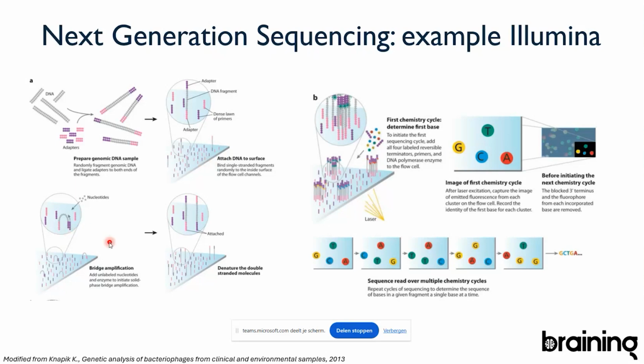And then to have a reliable readout, what you're going to do is a PCR, basically, on your flow cell. It's called a bridge amplification, but it's the same principle as a PCR. You use a polymerase to amplify the DNA strands, and this creates clusters of all the same strand. That's what you see here. You see here there are 4 clusters of DNA strands, all with the same sequence, that are shown here. And after you've done your amplification, that's where the real sequencing step comes in.